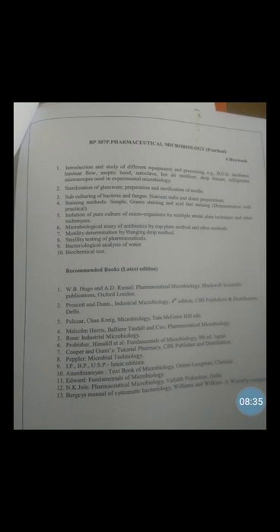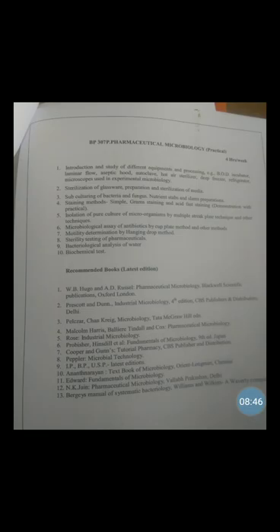From Petri plate A to C, there is dilution of inoculum and only a smaller number of microorganisms are allowed to grow in Petri plate C. And colonies develop on the surface and subsurface of the medium. So this is all about the observation and result.